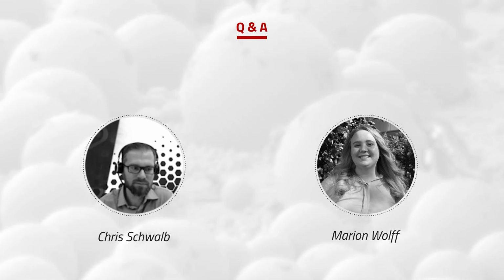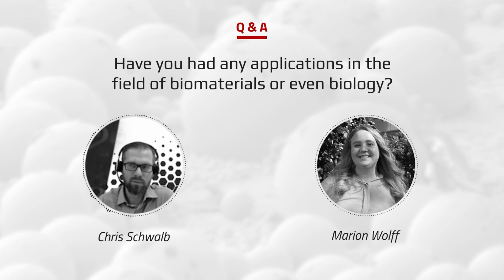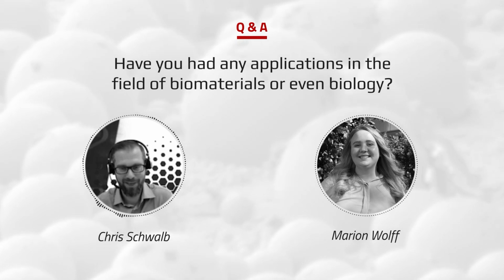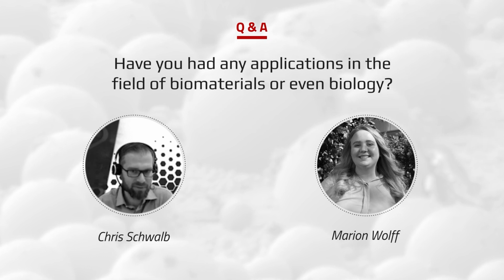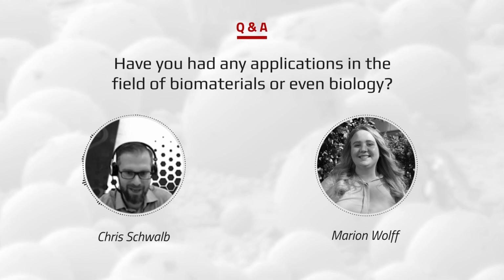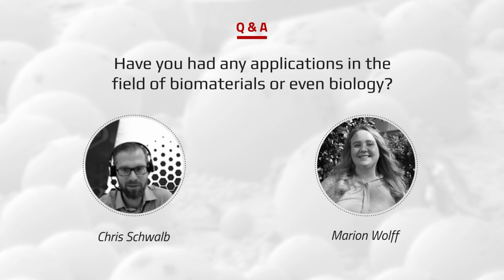Okay, thank you. Here is another question. Have you had any applications in the field of biomaterials or even biology? Bella showed you in this profile view video that we inserted a bone, which, I'm not a biologist, but is a biological sample. And of course, you can insert any sample that is vacuum compatible, like these images of fly eyes or something like that. So you would need to take care about some charging of a biological sample.